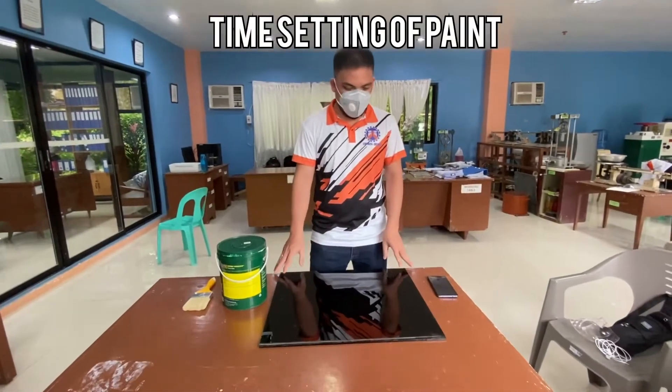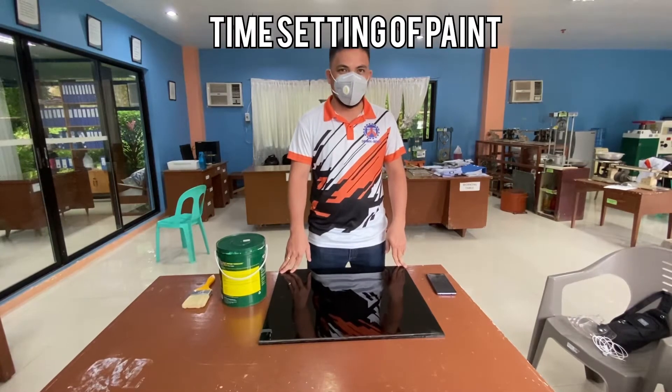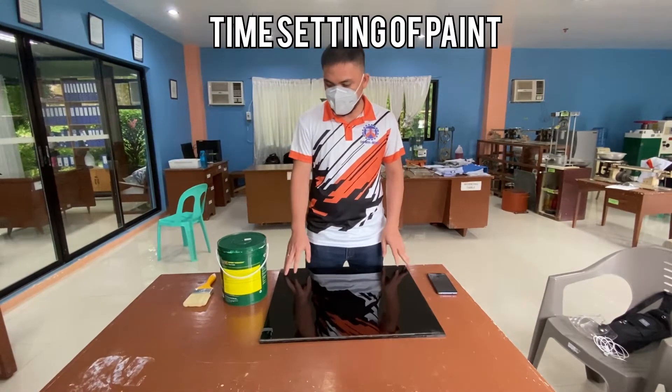Good morning everyone. I'm going to perform a drying time test of paint.